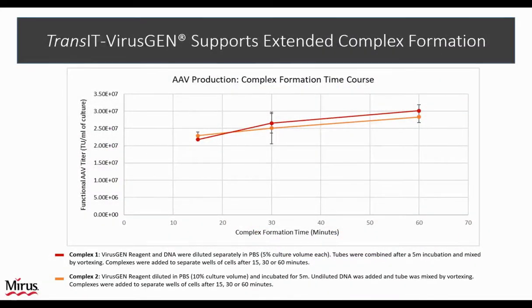I do want to pause a moment on the complex formation part of this process. This can be a pain point for large-scale LV and AAV production workflows when longer periods of time beyond the 15 minutes specified by our standard protocol for complex formation are needed for preparing and adding complexes to cells in bioreactors. Here we compare two commonly used complex formation methods and their stability over time.